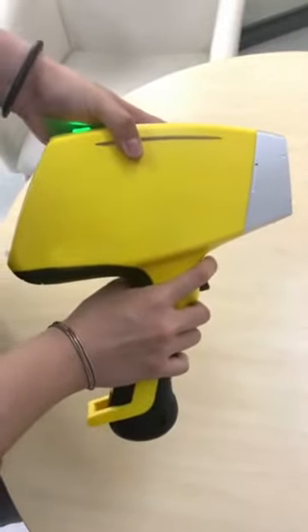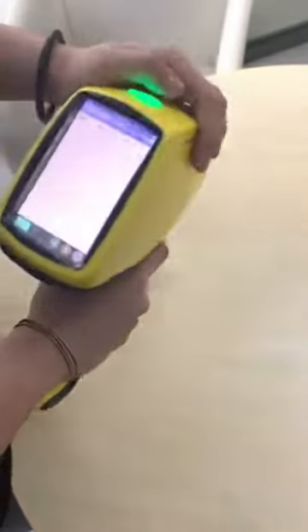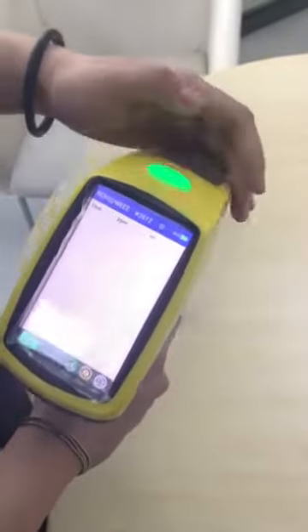This is our Truex handheld analyzer, and now I will show you how to use our instrument to test the sample.